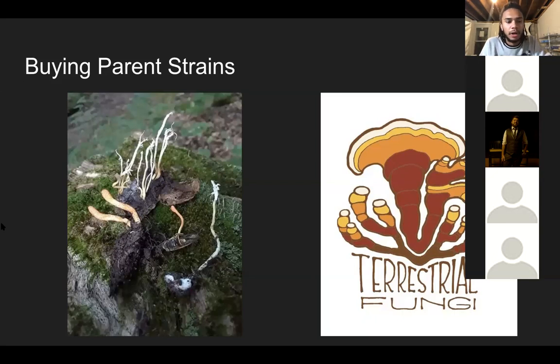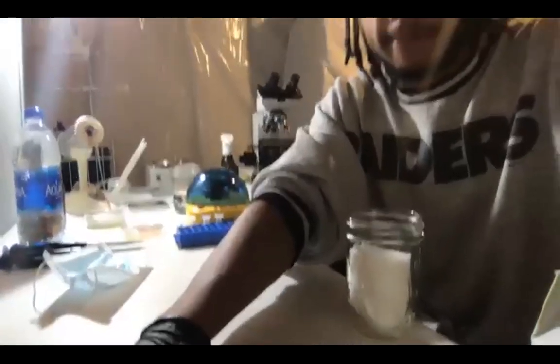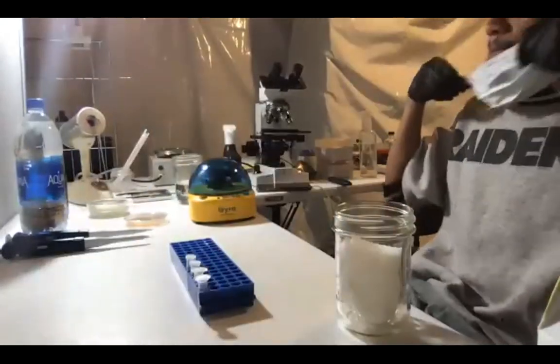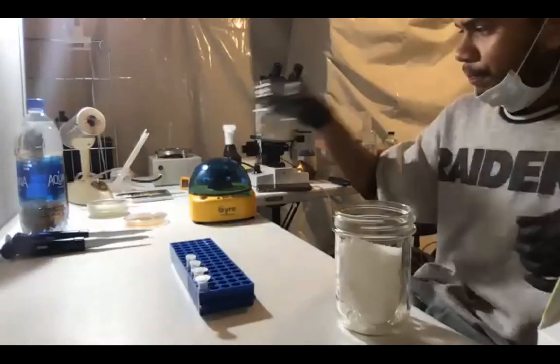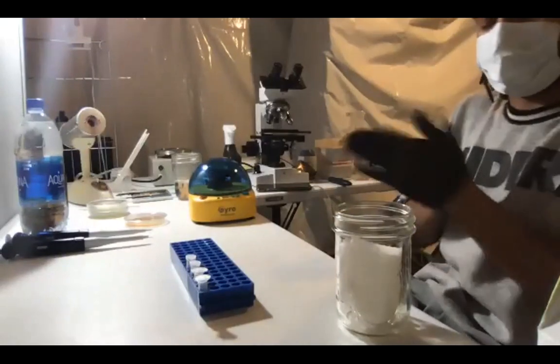So my timer just went off, so I'm going to pause this presentation, and we're going to get back to that in a moment. My timer just went off, so these have been at 95 degrees Celsius, and they actually did get up to 95 degrees Celsius for 10 minutes. Put my mask back on here. Take a sip of water. And spray my hands down because I was touching my computer.